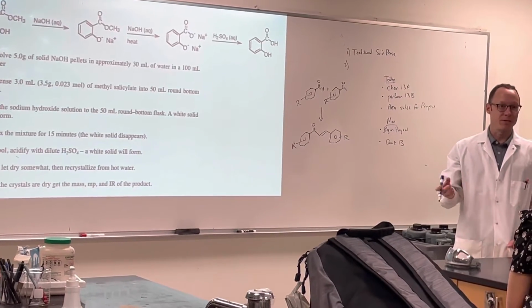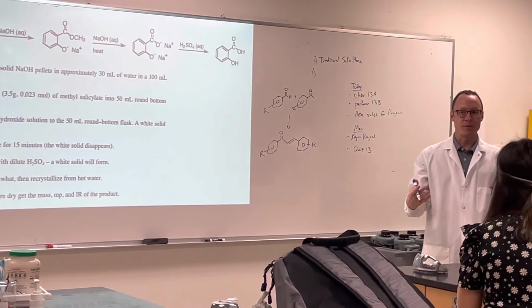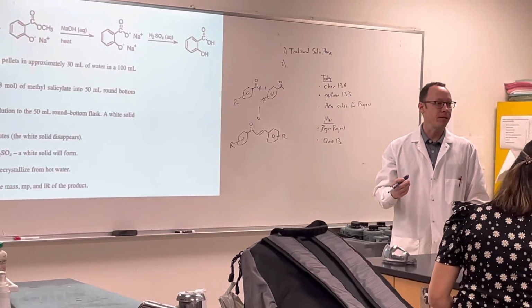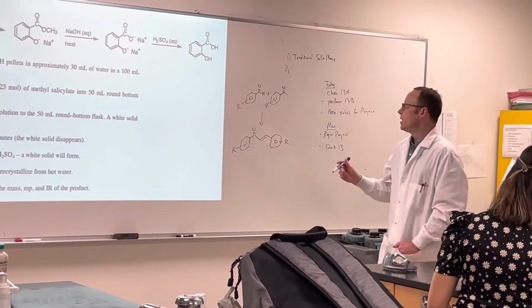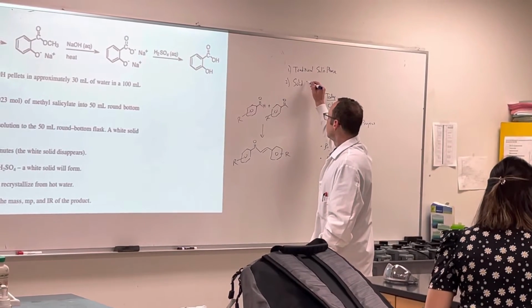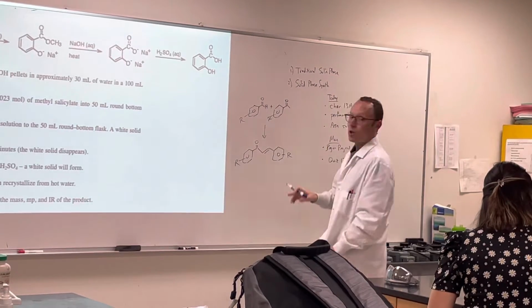You just take your starting materials, you dissolve them in a solvent, you'll reflux it or heat it. I don't think it's reflux, but you'll heat it for a period of half an hour or so. Just a normal run-of-the-mill reaction. The other procedure is going to be a solid phase synthesis, so solvent-free.